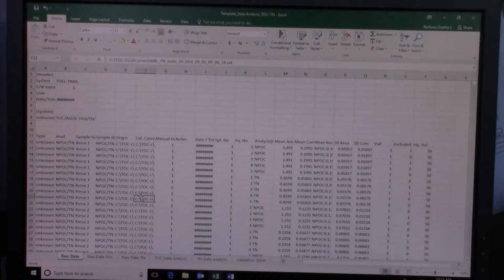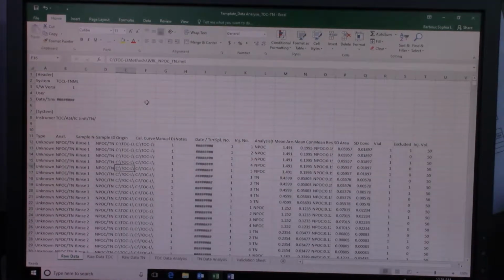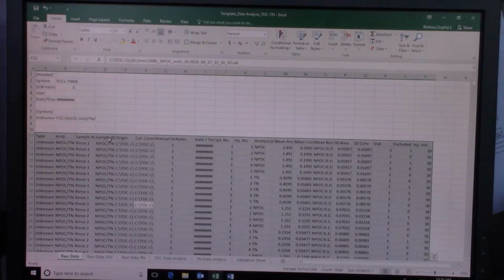The first thing I'm going to do is grab my table here. How do you do that? Sorry to interrupt, what key do you press? So I click anywhere on the data and press Control A once, and it highlights my table.